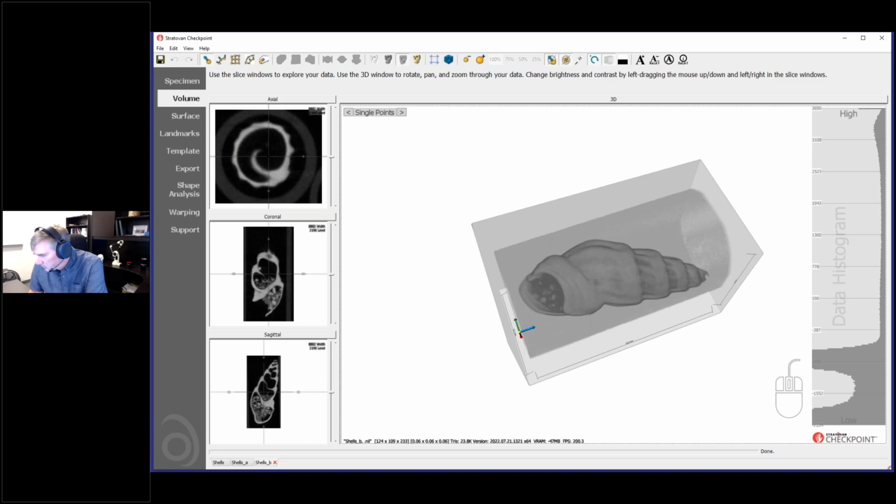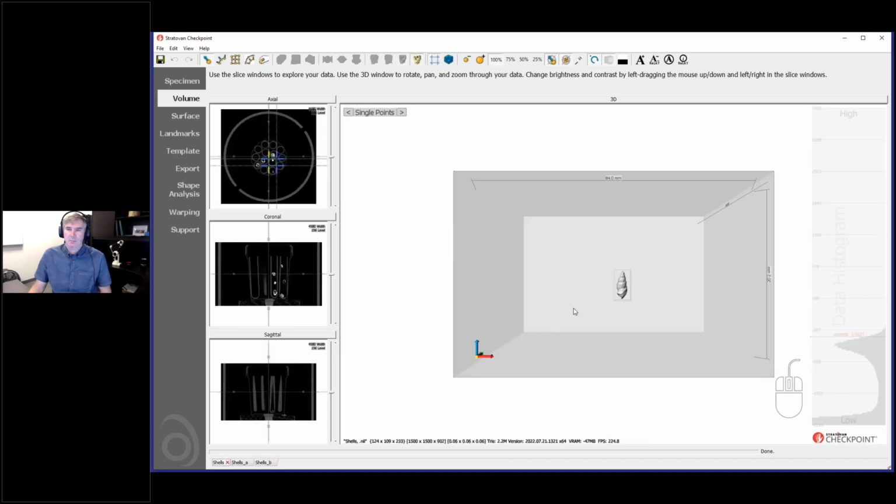I just want to go back and make sure. We talked about Chris Robinson's question regarding file size. We have another question. Someone saying they experimented a little, and in the export surface menu, you have the option of splitting the surface into parts. That seemed to work too, but I could not handle the volumes this way. Oh yeah, let me go back and do that. That's a good point.